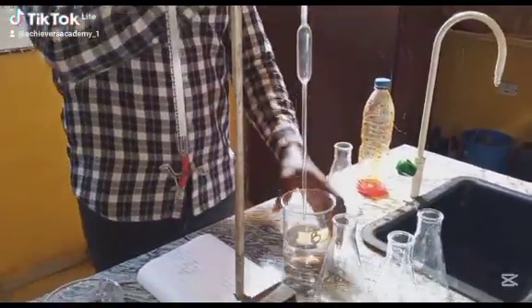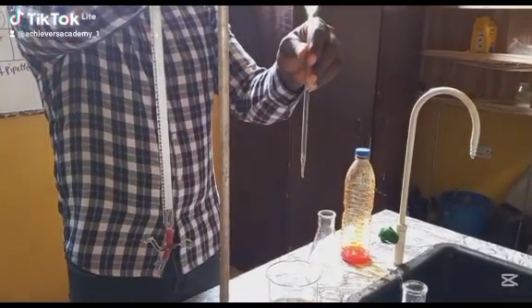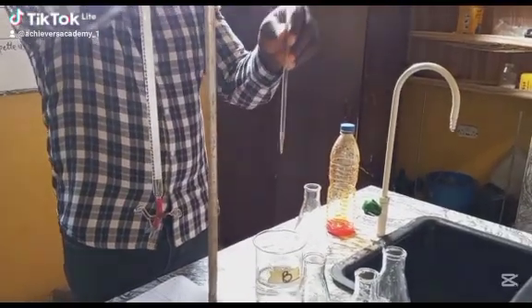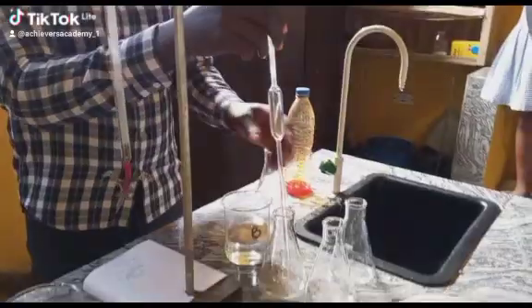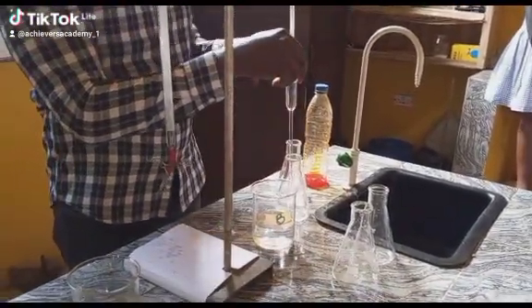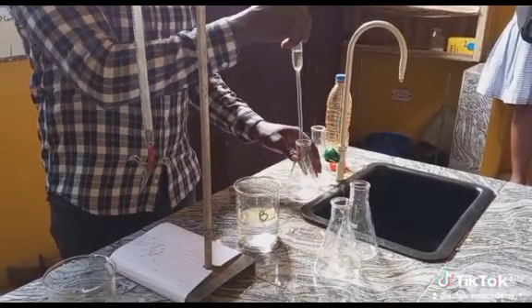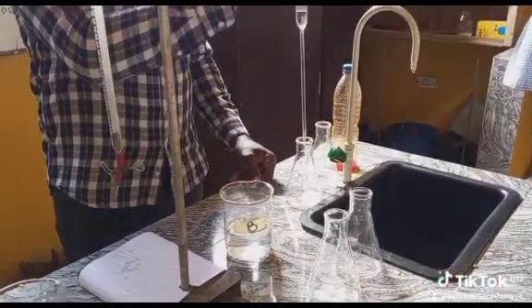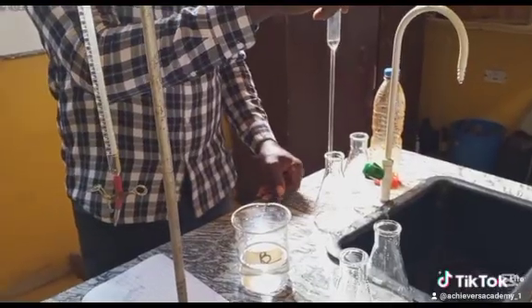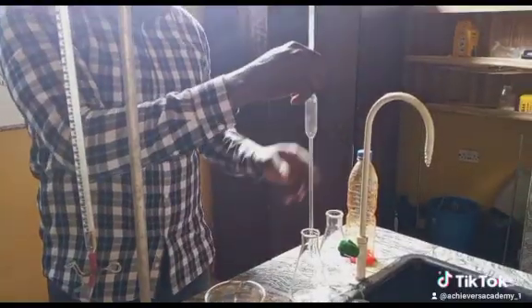Trying to separate the ones that are filled from the ones that are still empty so that I will not fill 2 times. What did you say? As I asked, where do you stop? When it gets a bit above this ring, then you stop so I can be able to take it down to the ring.